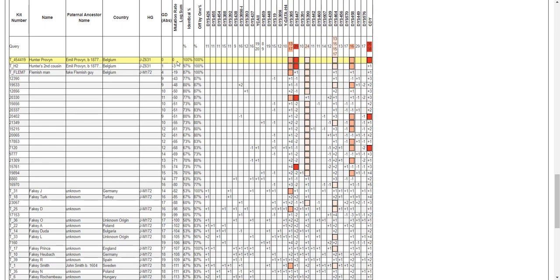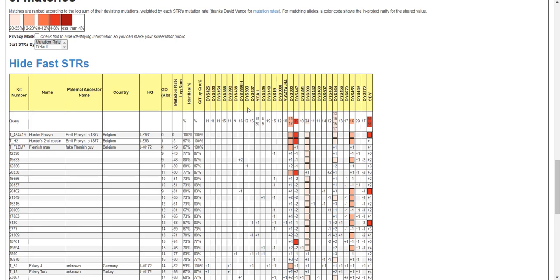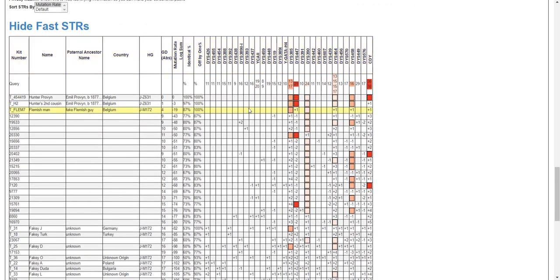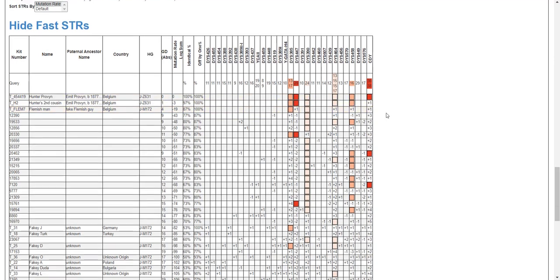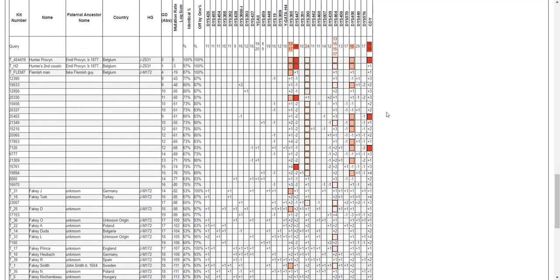The default view, the order of the STRs you see here, is not the standard order from my project that I imported or from FTDNA projects. This is the order ranked by the mutation rate. So the STRs that are appearing in the beginning are more stable, and CDY is the most unstable of the first 37, and that's why it's at the end.